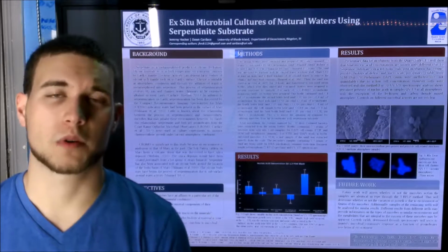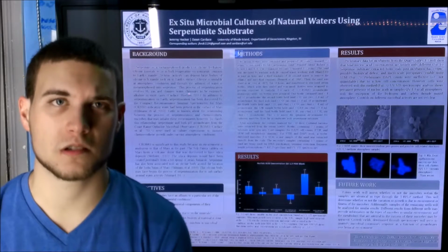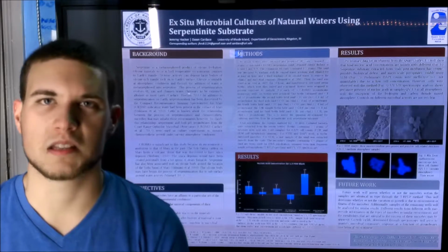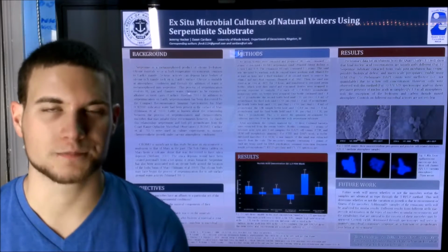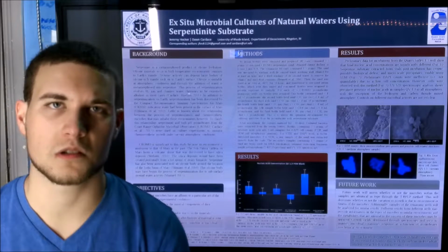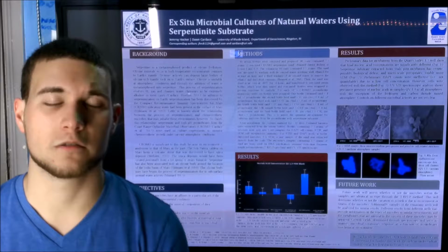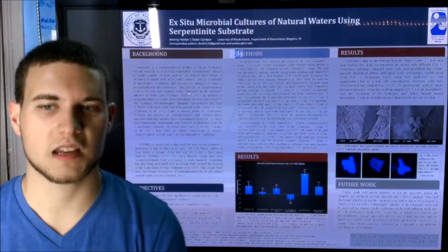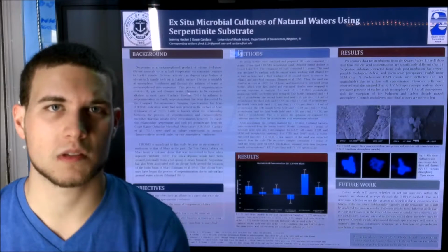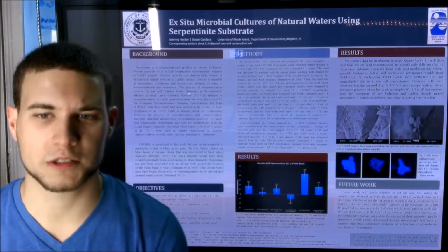After incubation of approximately 30 days, testing began. DAPI counts were attempted to determine growth yields, however the lack of concentration in the samples made this unreliable. Instead, ultraviolet-visible spectroscopy was used to determine nucleic acid concentrations as a method of determining growth yields. A scanning electron microscope was also used to try to determine the relationship between microbial chemosynthesis and minerals.